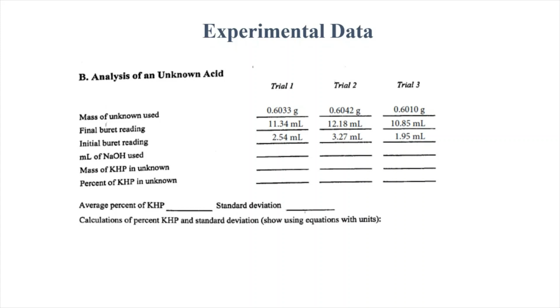The other thing I want to mention at this point is that whenever you're doing a titration, you have to keep in mind the difference between the equivalence point and the endpoint. In doing all of these titrations using an indicator, there is going to be a systematic inaccuracy. It'll be very, very small, but there will be a small systematic inaccuracy in all of those measurements. That's due to the fact that the endpoint is slightly past the true equivalence point, because it takes a couple of extra micromoles or millimoles of NaOH to get that indicator to turn, meaning we have to go up to a pH of 8.2, which is slightly past the equivalence point of a pH of 7.